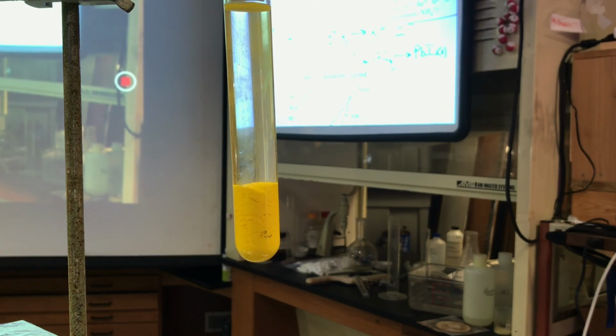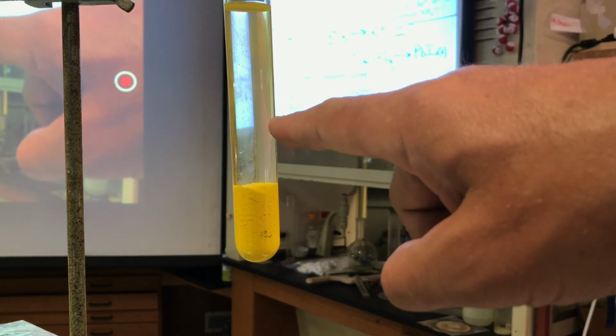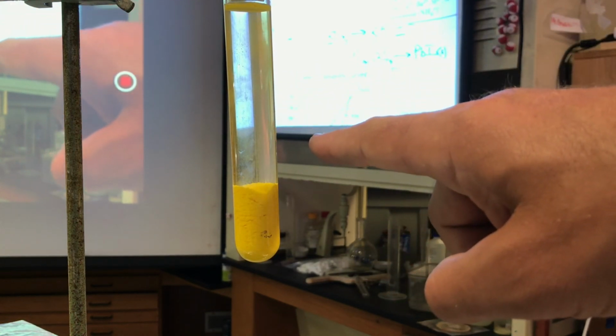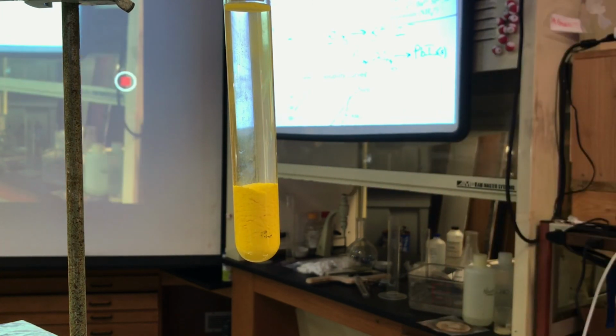Well, the nitrates from the lead. Remember, the lead nitrate delivered the lead ions. So there's still nitrate. In solution we still have water, potassium ions and nitrate ions. In another course you may write KNO3 as the product, but really it's K+ aqueous and NO3- aqueous. They don't come together as you may have written in a double replacement reaction.